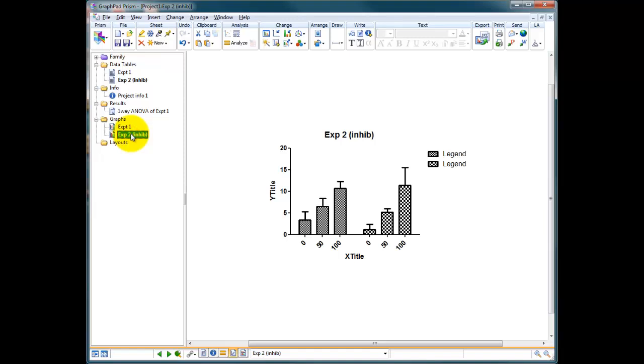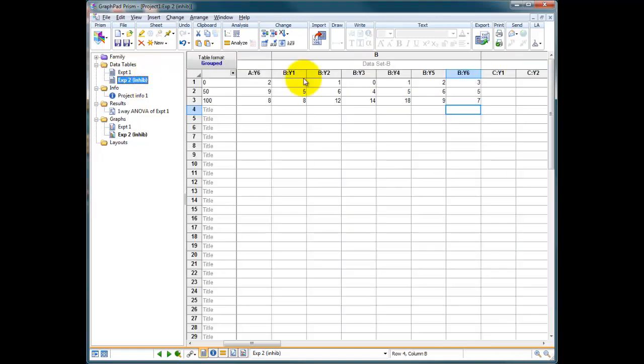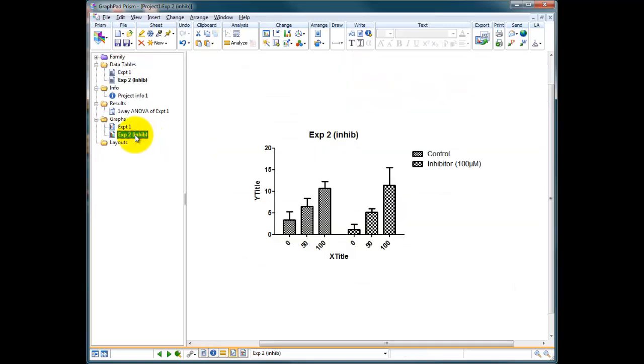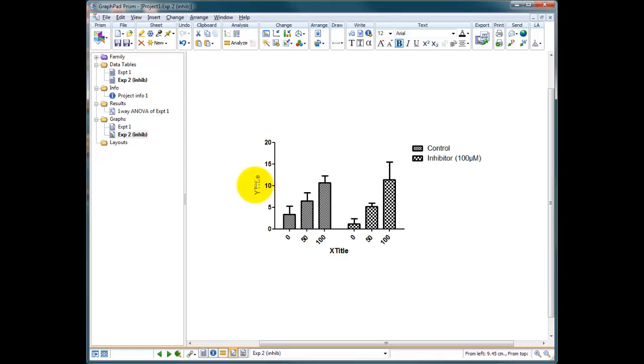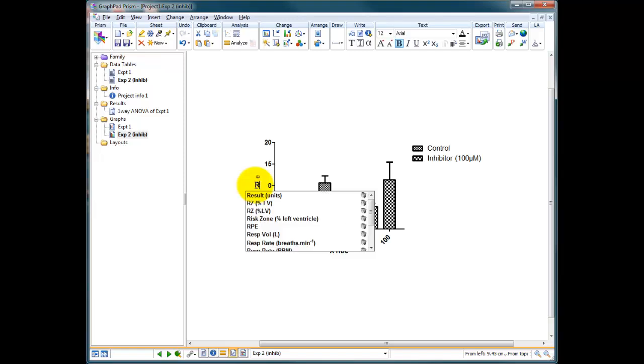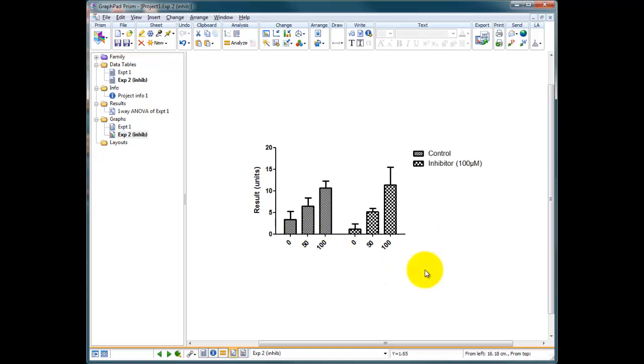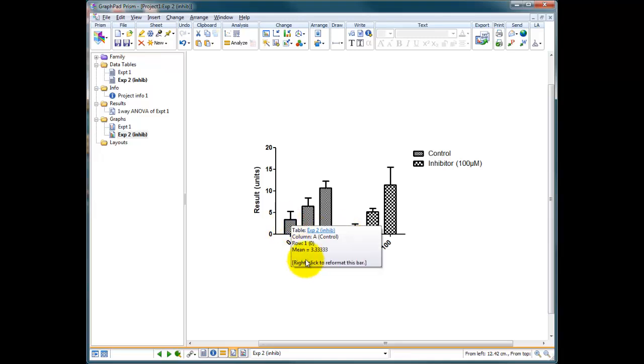And there we have a load of numbers. So now we can look at our newly formed graph and you've got here legend, legend, and a whole of numbers. It's written legend, legend because I haven't told it what I've done. So I go back up to the inhibitor. Data set B is going to be the inhibitor let's say at 100 micromolar, and data set A is going to be my control. So we go back to our graph and now we've got our experiment 2 inhib. Our y-axis title which is our result in units whatever that result may be. Down the bottom here we've got x title so I'm just going to delete that for the moment because I don't like the way these data are formatted. I want to be able to compare zero with and without inhibitor and see it on the screen a little bit better than this.